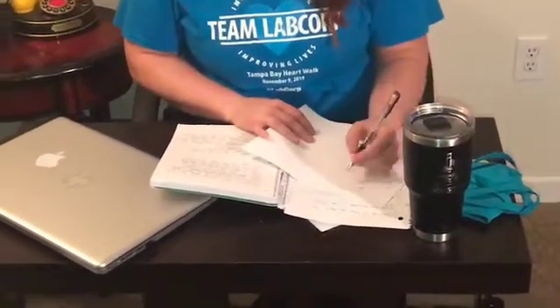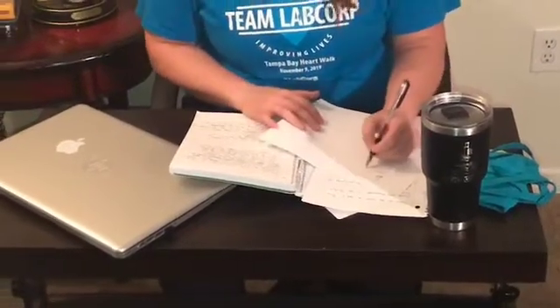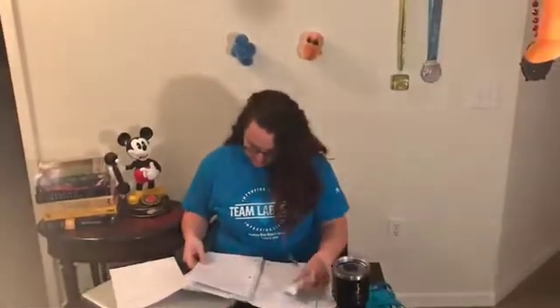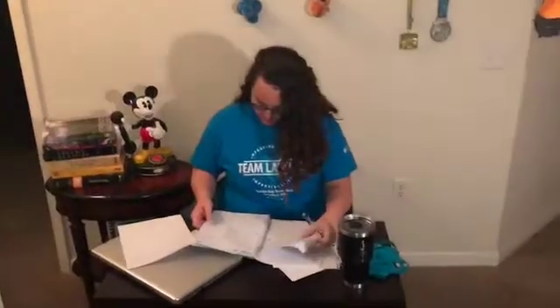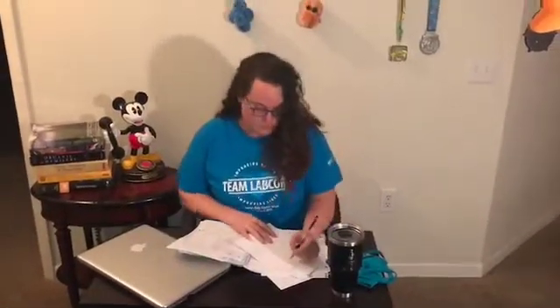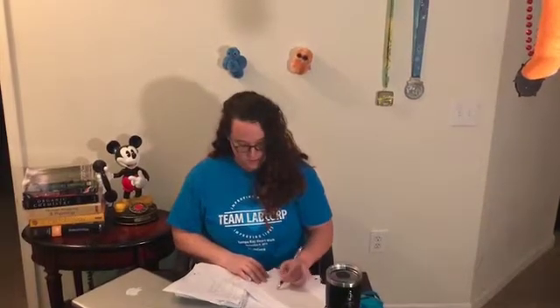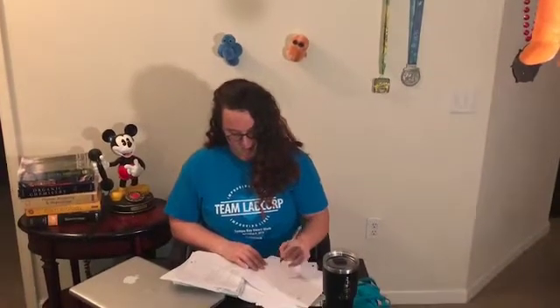And we'll throw some numbers. So for the first one, we'll say we get, actually, let's see if I can find some data here, because we've been doing an experiment ourselves. So we will look and we'll say what? 0.4 for 0 will be 0. And then we'll say 0.5 is 0.8, right? So you'll have your table, X and Y's, and we'll go ahead and do a scatter plot. You usually do this within Excel. And then we'll just kind of scatter. So that's what your scatter plot will look like.